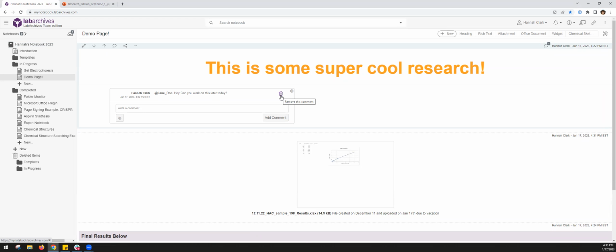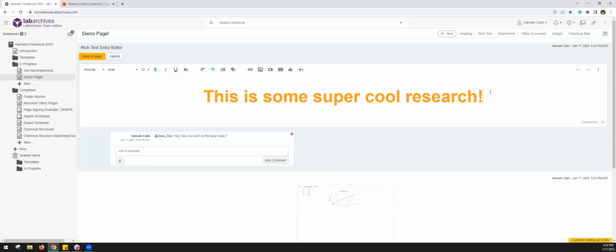But the reason that's helpful is you can talk as you normally do. Joke around, use it like a Slack or a Teams or that chat sort of thing. And when you want it to go away, the trash can icon. So it's not part of the permanent intellectual property that the rest of your notebook might be. If you want to have that kind of formal dialogue, do that in line. Give the feedback in line within the entries, within the office documents.